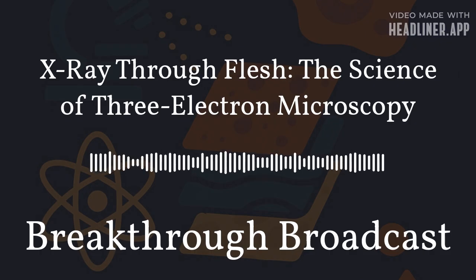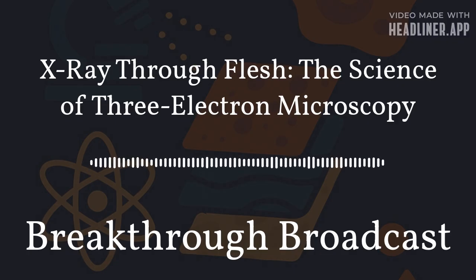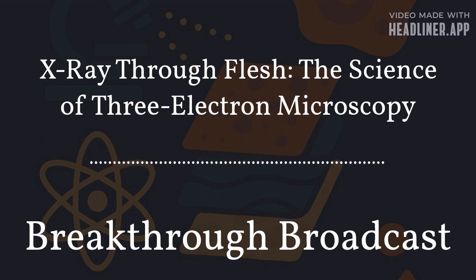All of this also must happen in a vacuum chamber. Electrons can't travel through air without being scattered, so the microscope must maintain a vacuum nearly as empty as outer space. Pumps, seals, and sensors constantly work together to keep the environment stable. The electron source itself also needs to be consistent. Even minor fluctuations in the emission pattern can interfere with the combined signals and reduce image quality.